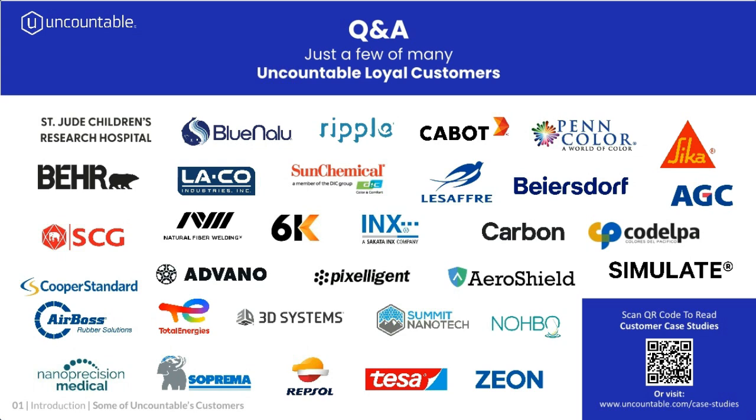A data management system like Ganymede sort of pretends like the most important data is the data that's automated, that's automatically collected from a piece of equipment. And the truth is that that's not necessarily the most important, that's just the most accessible. And if you have a coding background, it's the data that you end up using. But the context for what's happening in the experiment process, giving scientists the opportunity to explain why they ran an experiment, more information about the setup that they did, the parameters, all of that, that's equally, if not more important, and the stuff that's harder to collect.